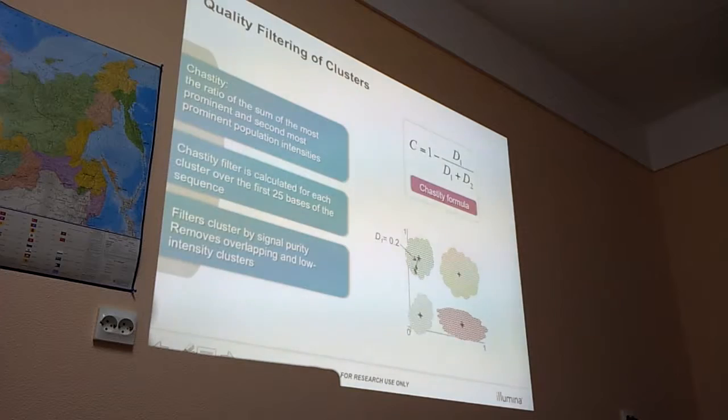So here you're looking at this spot, and this is the center of this cluster. So you take the difference, and this is the difference in intensity, and this is the next cluster. And you take also this difference, and you use this to calculate this formula.